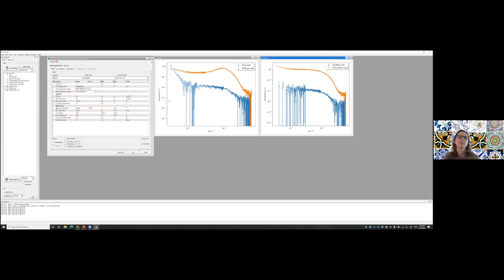There may be something about this low Q upturn on the 1 mg/mL data that goes beyond air bubbles; we don't really know. But that's something I will leave for you to think about, and we can discuss it at a later point if you'd like.